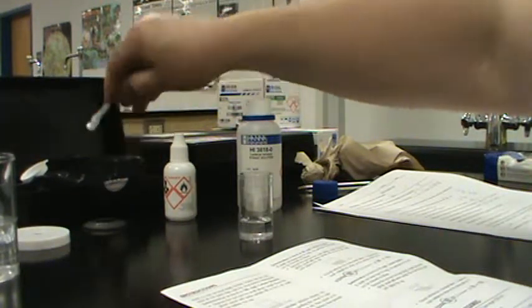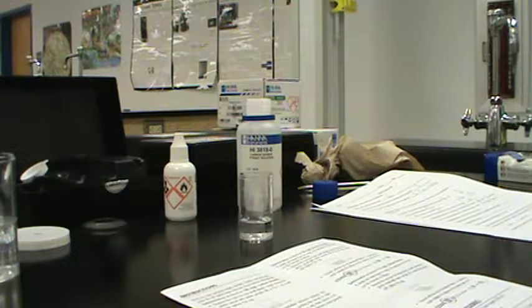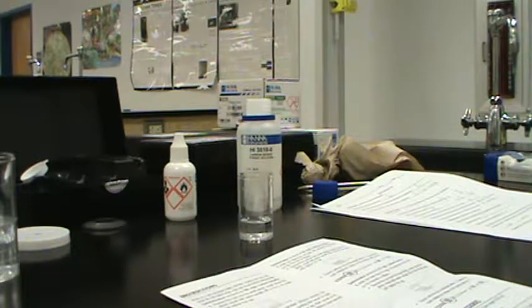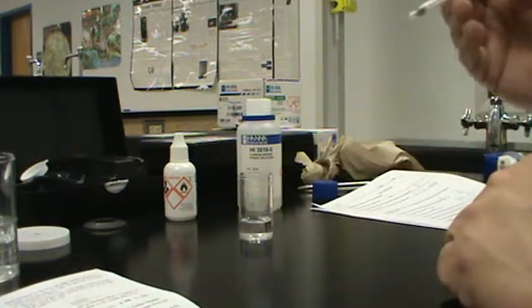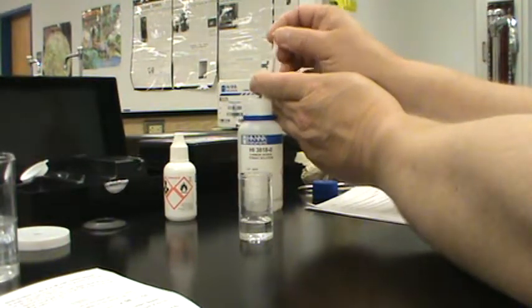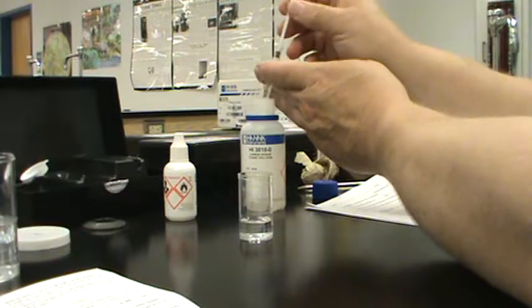We take our titration syringe right here, put it into the titration solution, and we are going to start doing drops. We're going to continue adding drops until the solution turns pink. Each drop is approximately 0.3 milliliters.